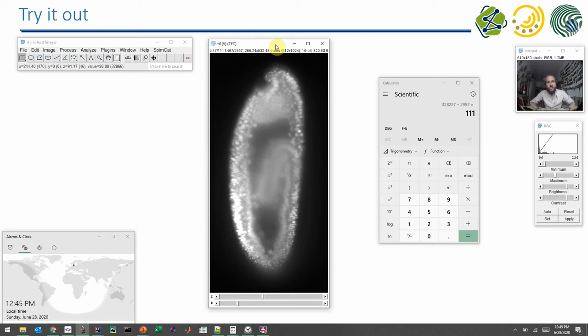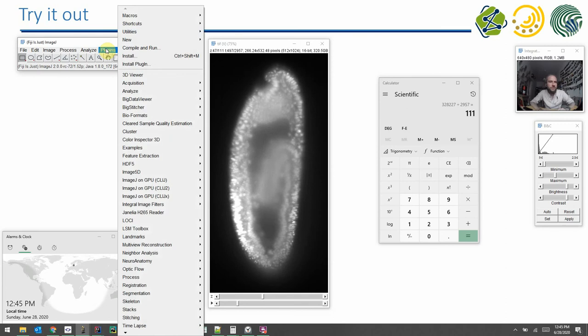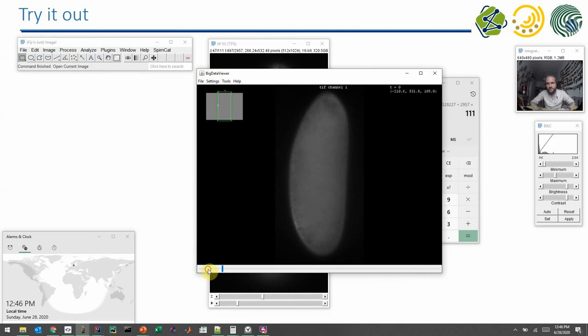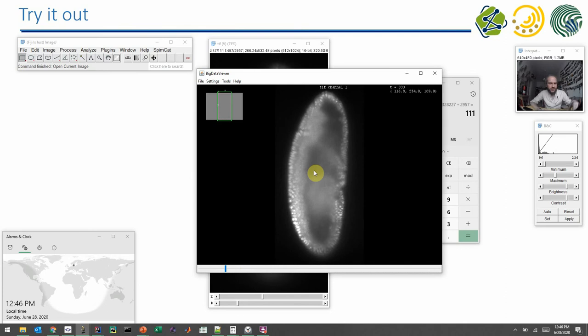What is pretty more recent is the Big Data Viewer. If we go to the plugin menu, you find the Big Data Viewer. You can open the current image in the Big Data Viewer. The Big Data Viewer has this time bar here on the very bottom, which allows you to take a look at certain time points.